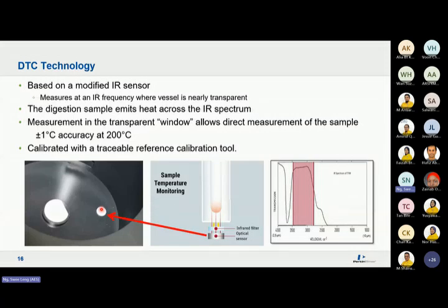the magnetron's energy. And this slide is telling you, as I said just now, the signal that we choose for the IR thermometer is porous to the Teflon. So we do not measure the surface, but the actual sample temperature. And if you look at the pharma companies, they need an NIST standard to do the PM.